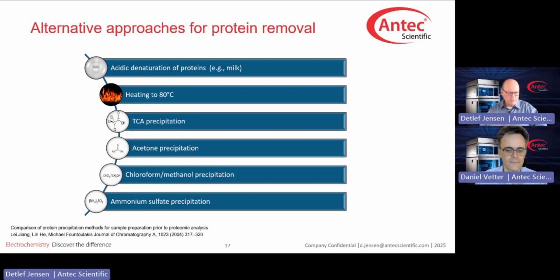So you have a denaturation without the addition of an agent, a reagent, into your sample, and you can separate the aqueous from the organic layer, and then can continue with the determination of carbohydrates. You would precipitate, you would spin off, you would ultracentrifuge or filter, and then you will continue. So that's the reason why I like the chloroform methanol precipitation a lot.